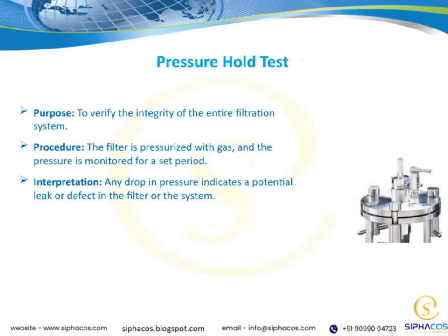Now, let's talk about the purpose of this test. Essentially, we're aiming to verify the integrity of the entire filtration system. It's a crucial step to ensure that everything is sealed properly and functioning as it should.